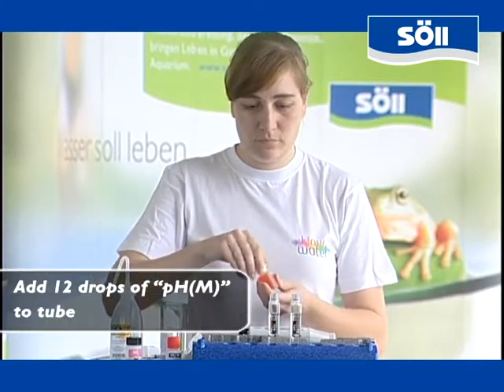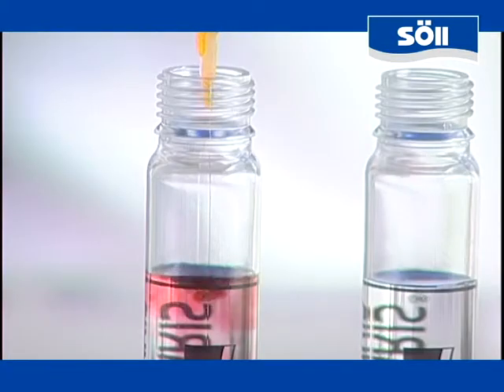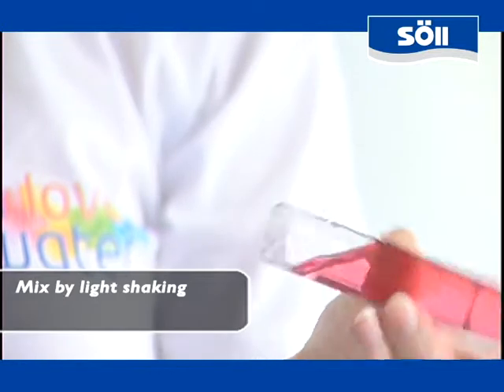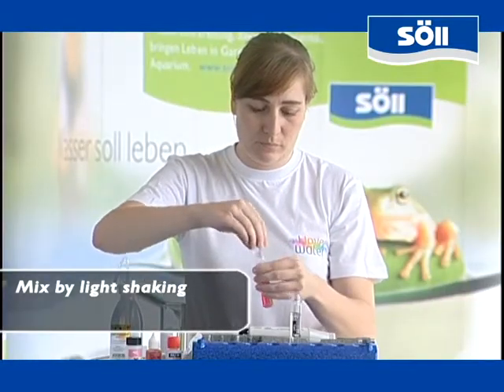To measure the pH value, open the small bottle with the respective label. Add 12 drops of this orange indicator liquid to one of the tubes. Then close the screw top and mix the indicator liquid and the water by lightly shaking the sample. Afterwards you open the sample and place the tube into the mini-lab.